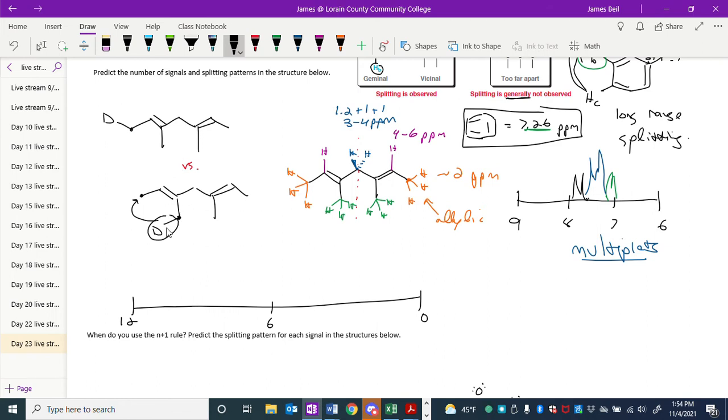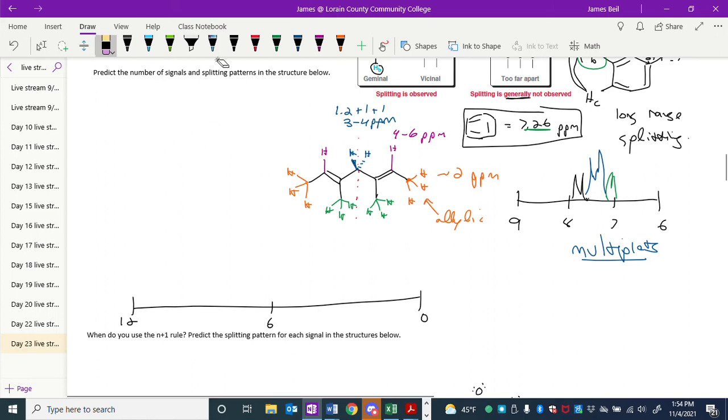They're not enantiomers. So since they're constitutional isomers, or even if they were diastereomers, even though they're not, if they're constitutional isomers or diastereomers, that means those protons are not equivalent. Right? So by doing the replacement test, I find replacing one with the deuterium versus the other gives me two totally separate structures that are not enantiomers, nor are they the same. So that tells me those protons are different. So definitely, even though I would predict a similar shift for them because they're both allylic methyl groups, and I would expect this also around 2 ppm, they're not exactly the same, so they'll probably have different enough environments to shift to slightly different positions.